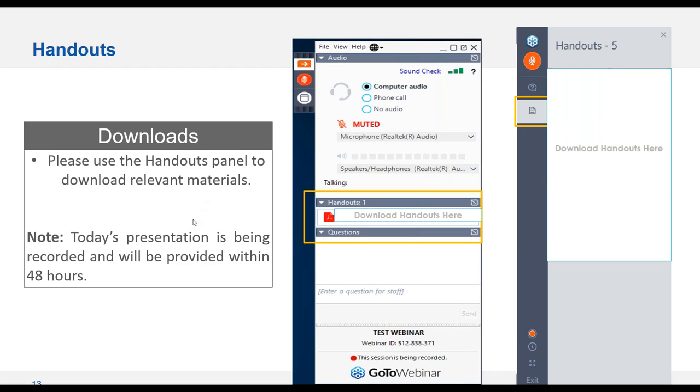It might be a little more critical, I've seen, when you have hydrochloric acid present. Hydrochloric acid is a little bit more volatile, and the more hydrochloric acid you have, the more volatile that matrix is. So that can affect the particle size more. Good point. You don't see it as much with nitric, but more with HCl for sure.